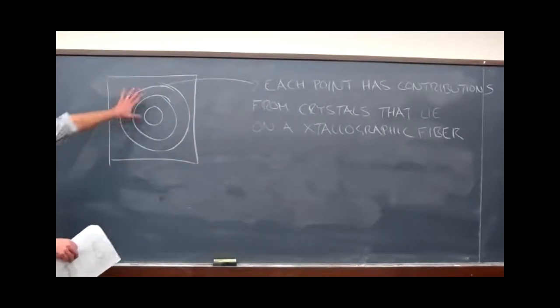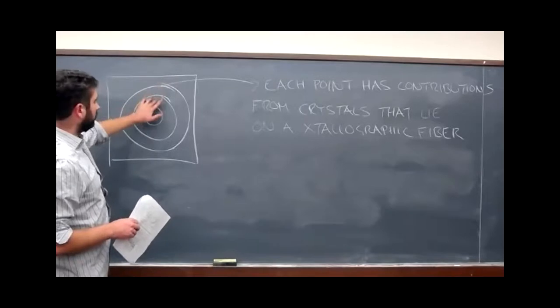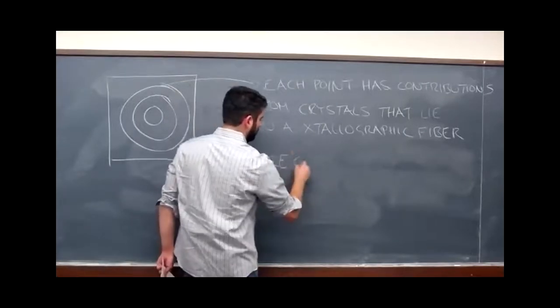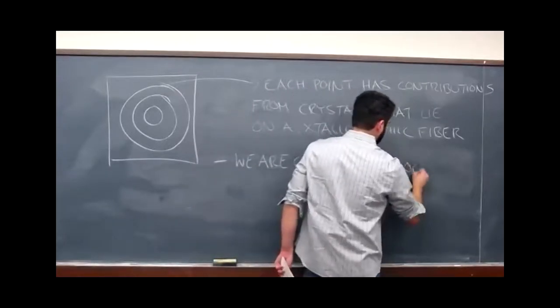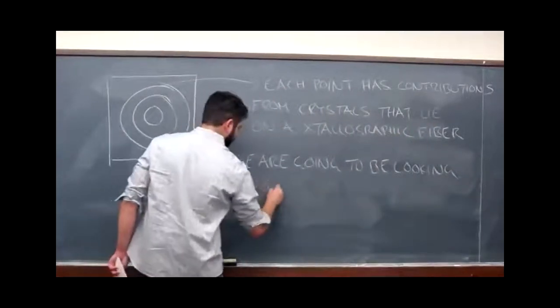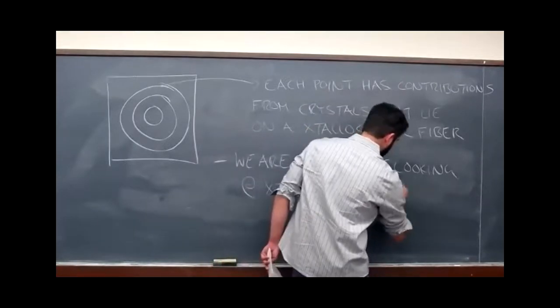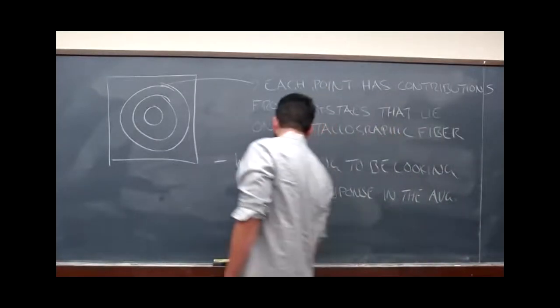But since at each point on these rings we have lots of crystals contributing, we're going to be looking at crystal response in the average sense.